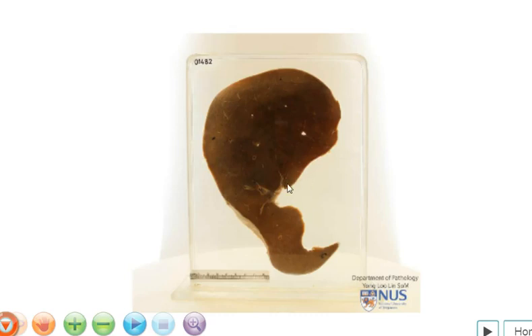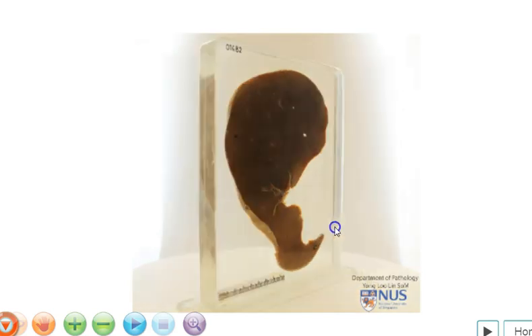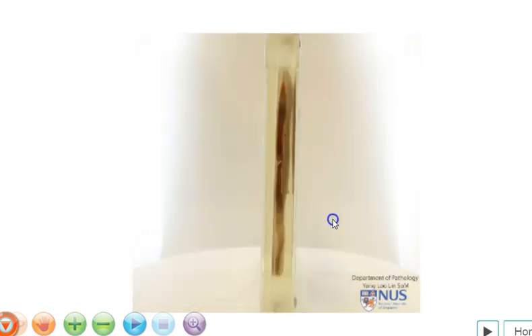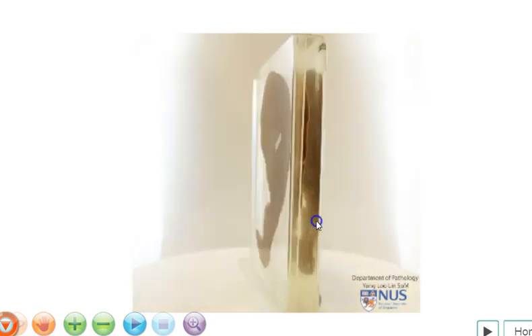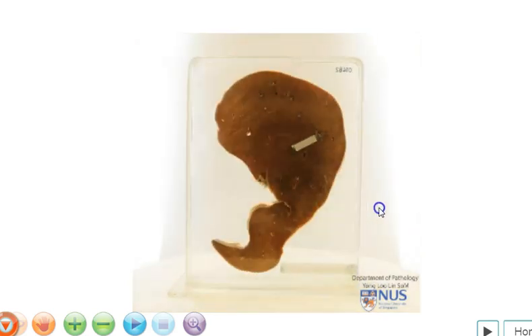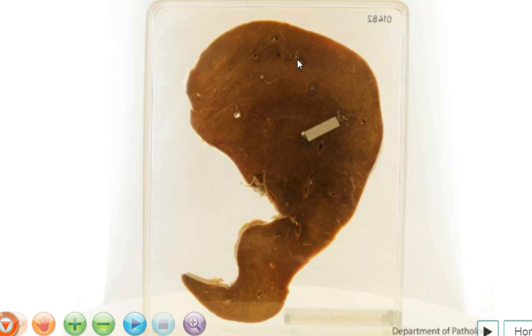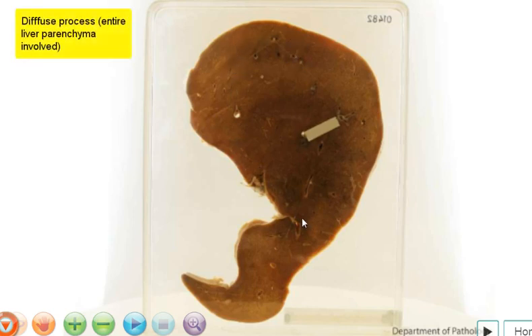Hello. This is a slice of the liver, and here is one cut surface. I'm just going to turn it around to show you the opposite surface. And looking at this, we can appreciate that the pathology is a diffuse one.